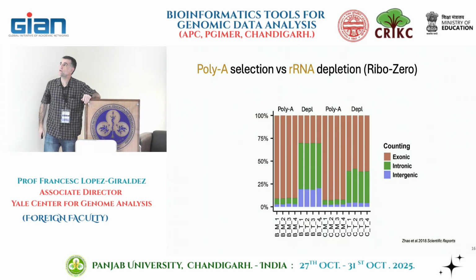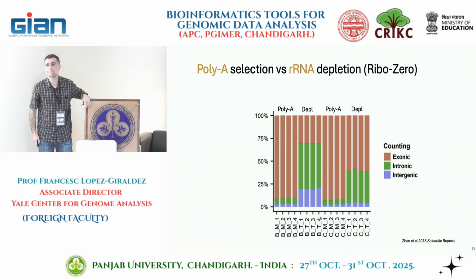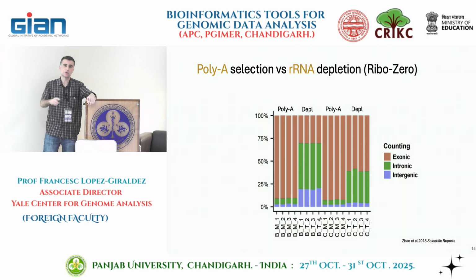I have a question: if you want to do only microRNA or small RNA, you can also size select them. Yep, that's true. That's a good point.